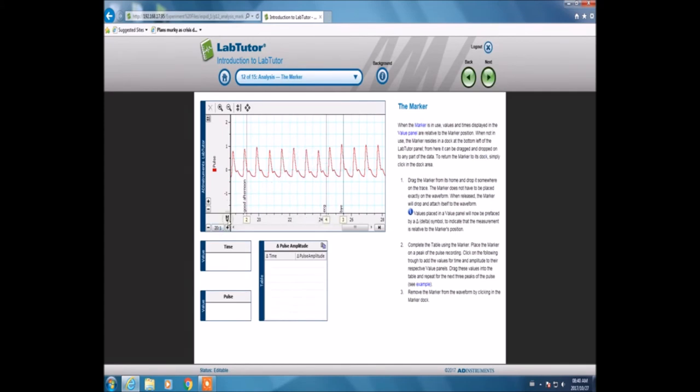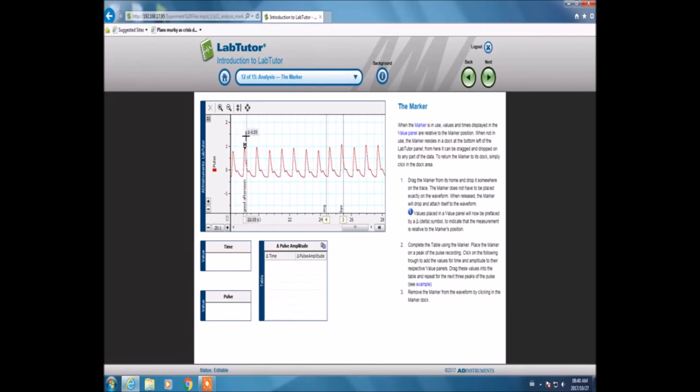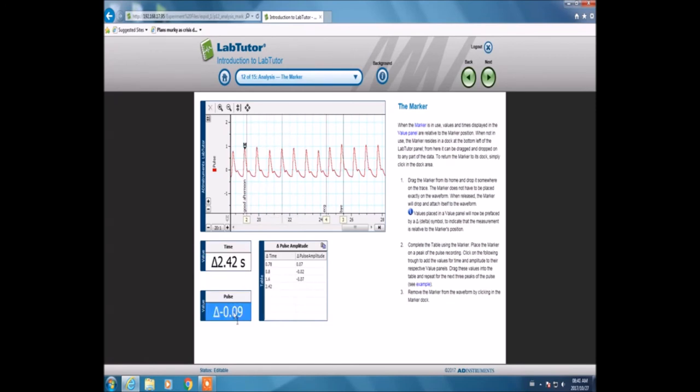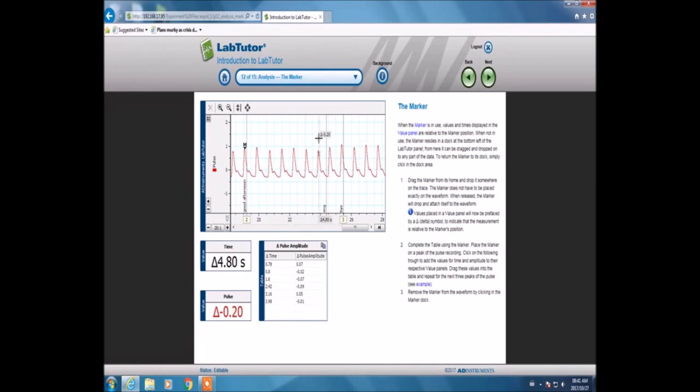Now we're going to use the marker, located in the bottom left corner. You can place the marker on top of any peak or anywhere on the graph, then calculate the difference in height and difference in time. Whatever point you select, the data given will be in reference to the marker point. Here we are calculating the delta according to time and delta according to pulse.